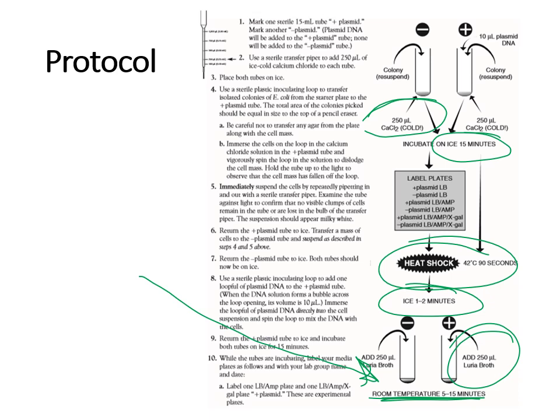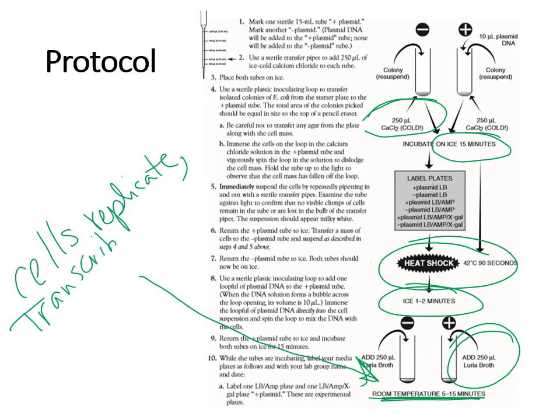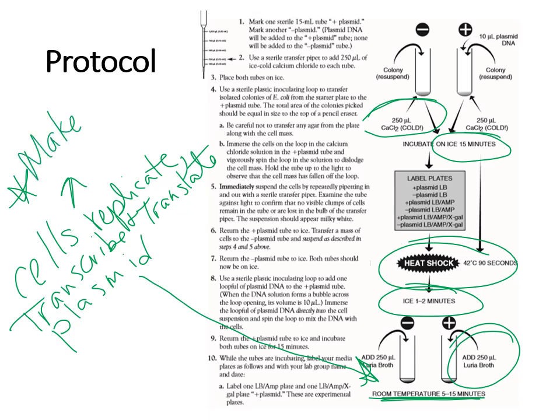That's the step so that the cells have time to replicate and, more importantly, transcribe and translate plasmid. So specifically, the whole point of that is so cells have time to make the protective proteins.